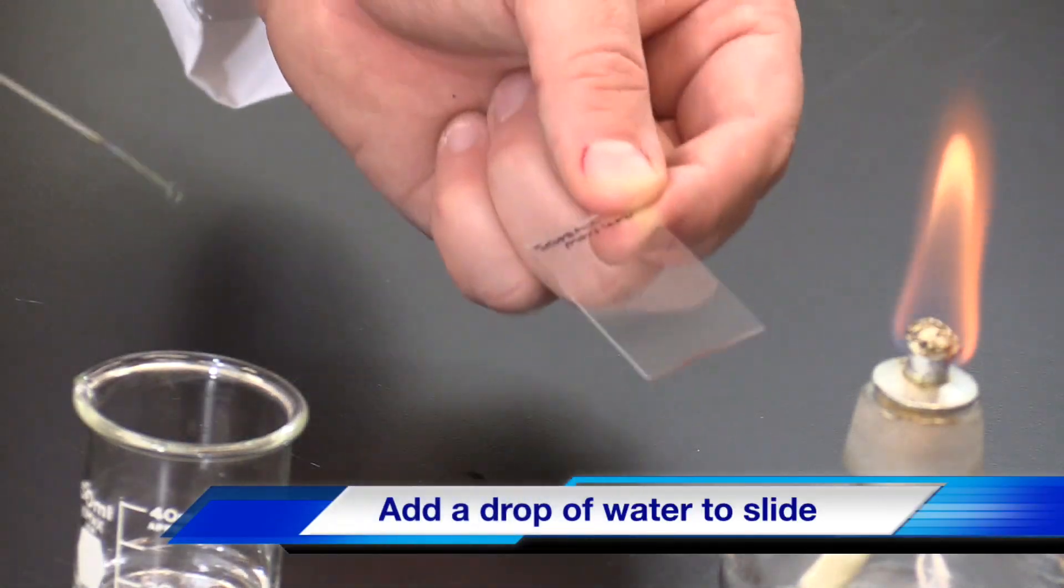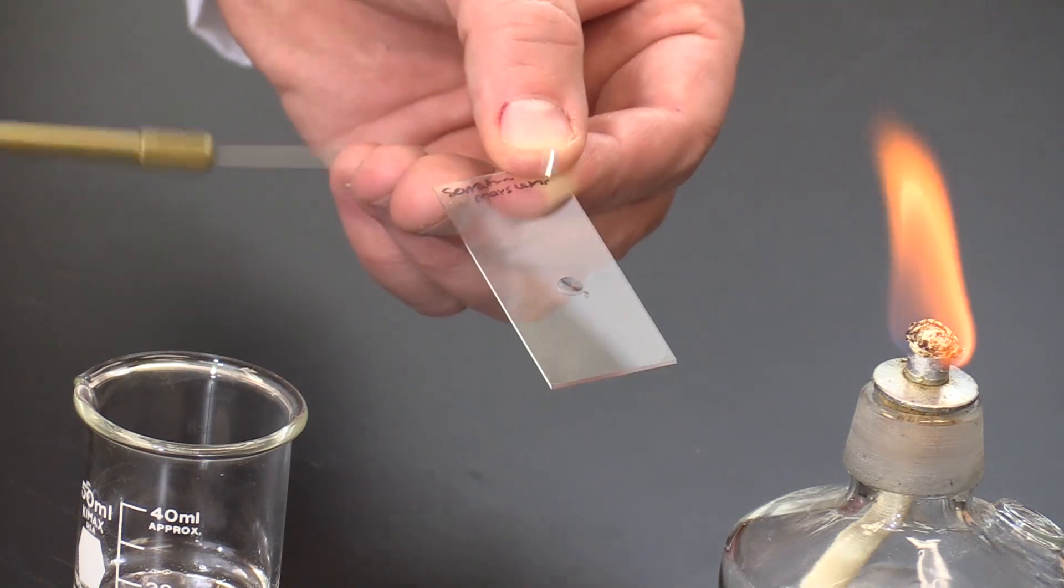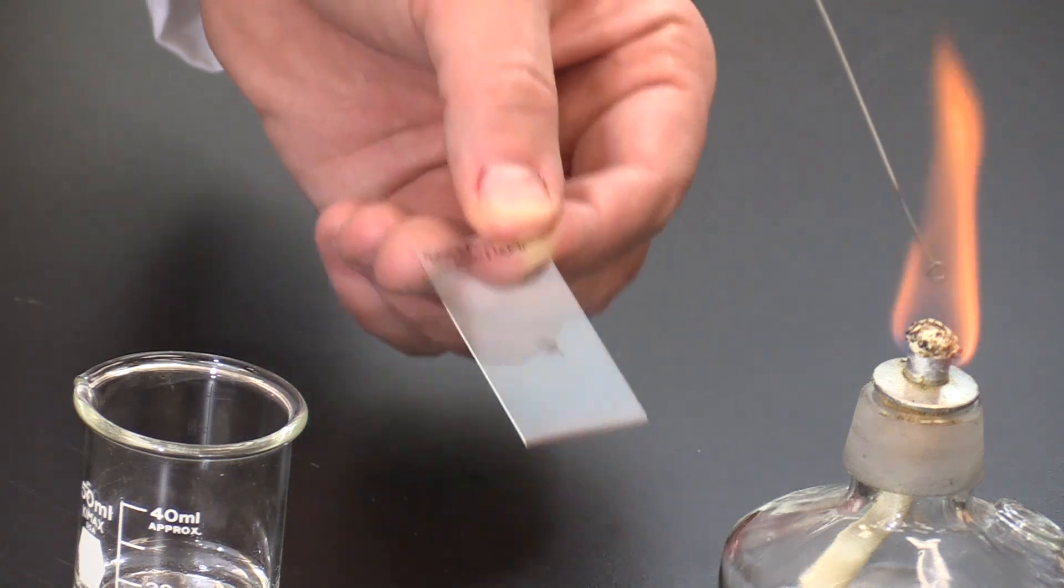Using the loop, place a small drop of water onto the slide. Lightly tap to transfer. After transferring the water, reflame the loop until it glows red.